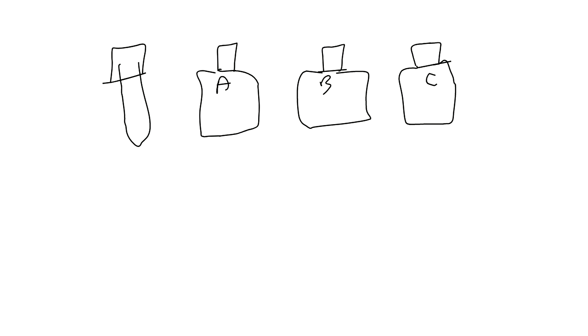Okay, so what we have is the test tube, and then we have 3 bottles, A, B, and C. Each one has 99 mils of water.